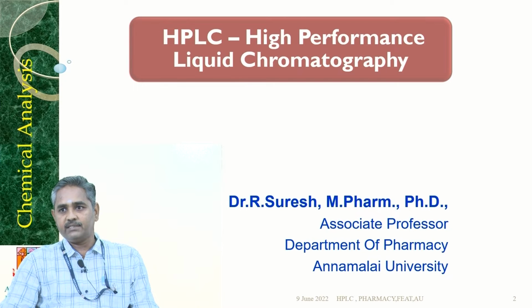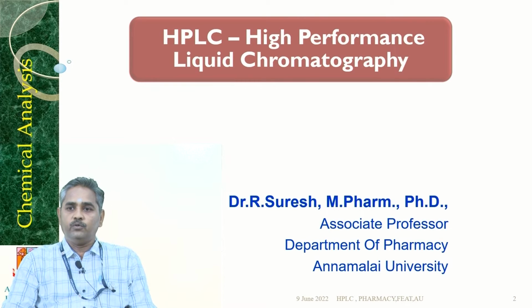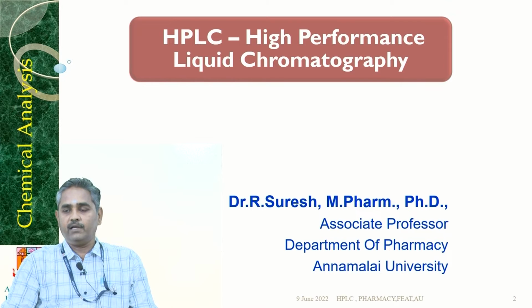There are two phases used in the HPLC separation. One is the mobile phase and the other one is the stationary phase. So, we should know their solubility to take the solvent as a mobile phase and select the stationary phase for separation of these chemical compounds. HPLC's main purpose is to separate and analyze a given unknown chemical compound.